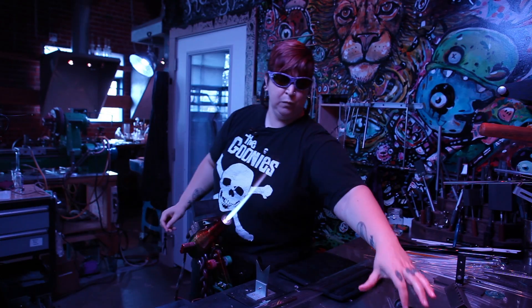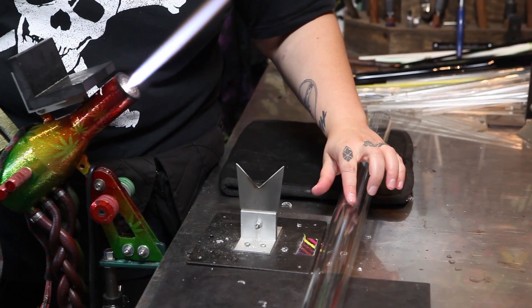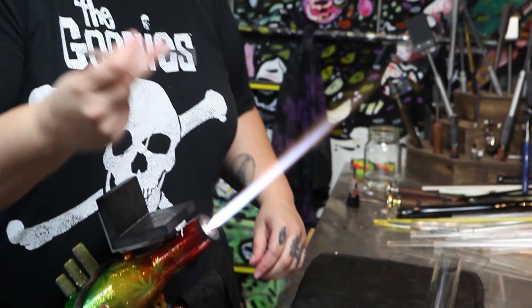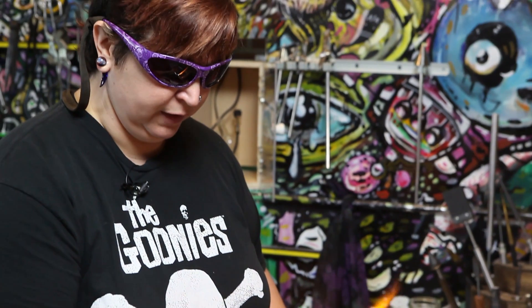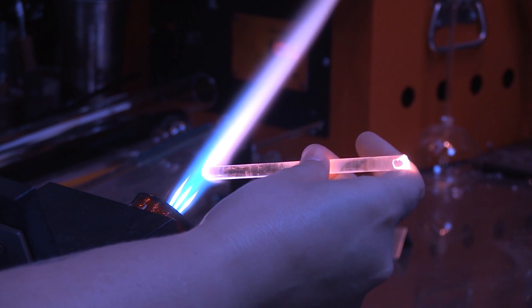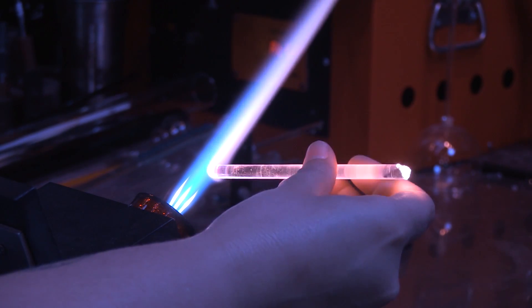Then you want to take some water or spit, whatever works best for you, and dab a little bit on your score mark. Then you're going to take just a regular old glass rod and heat it up in the flame until it turns white hot. You want it to just be at the very tip of the rod — you don't want to build up a ball here.